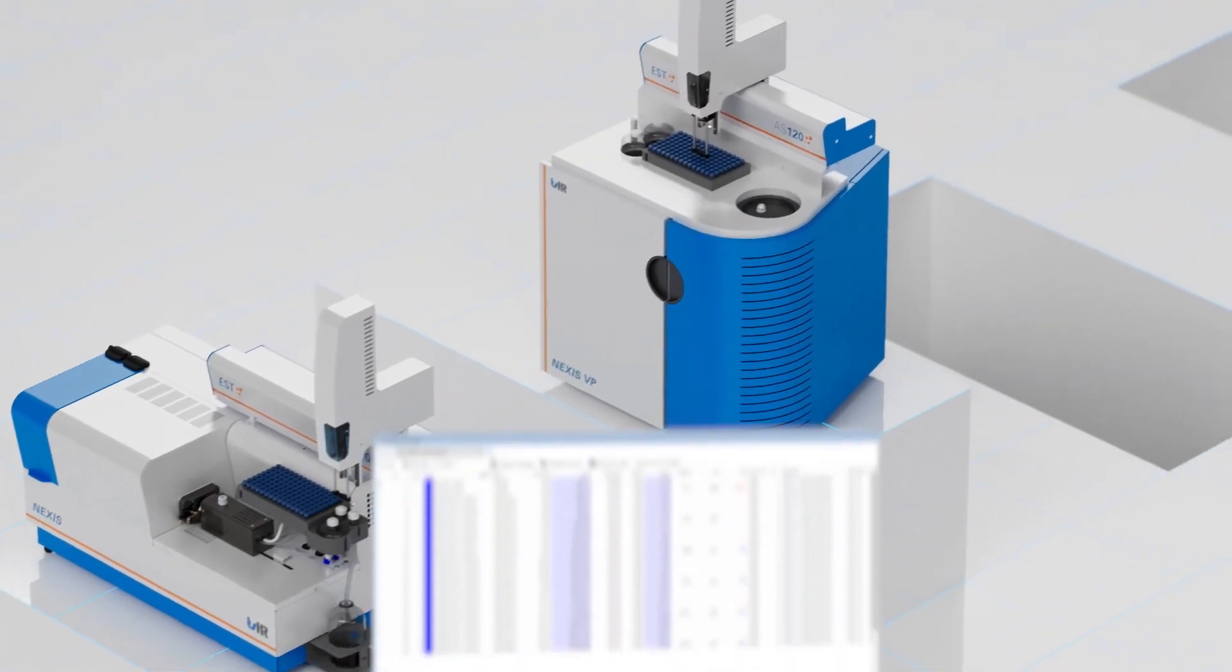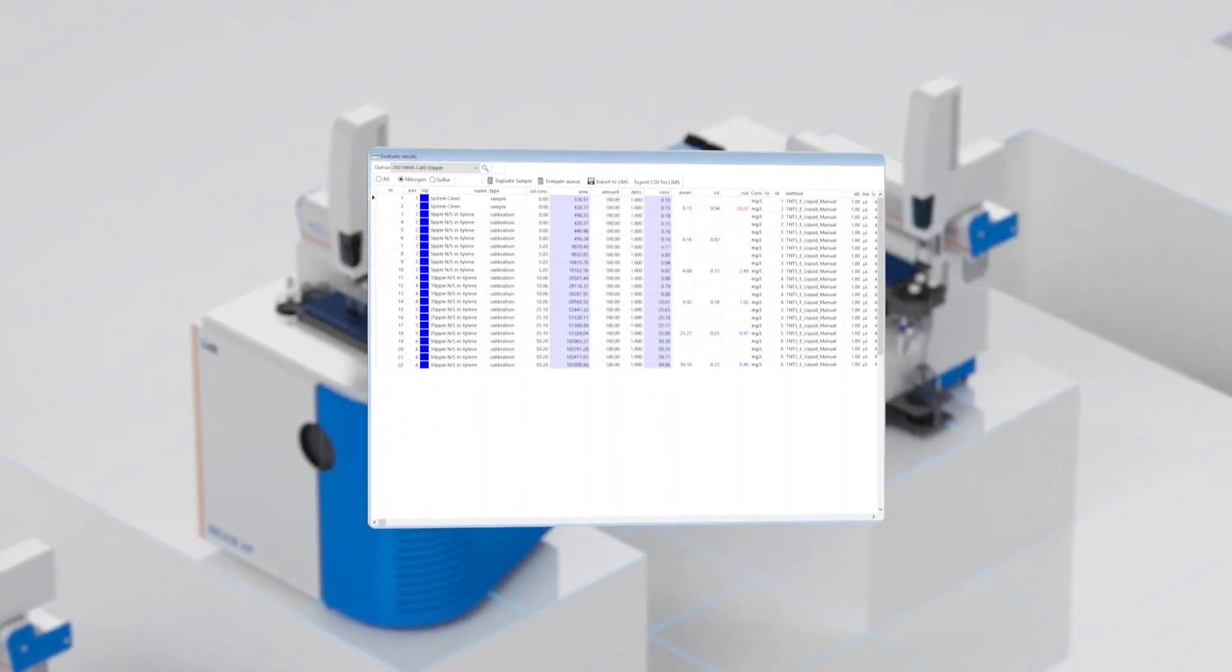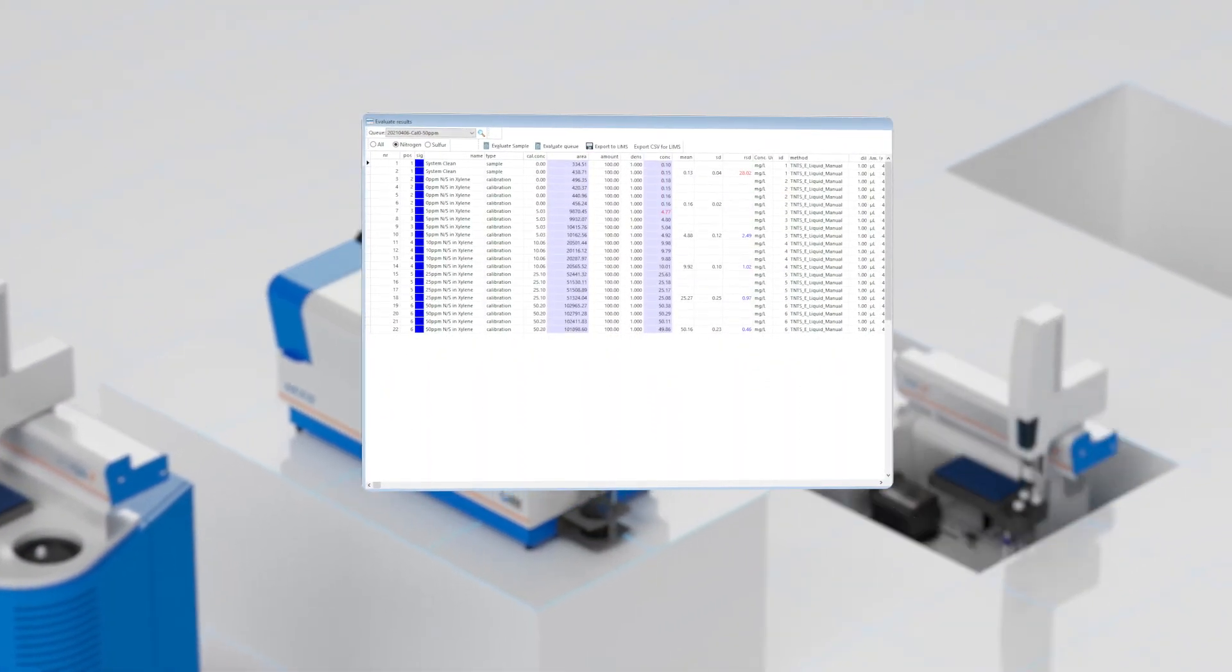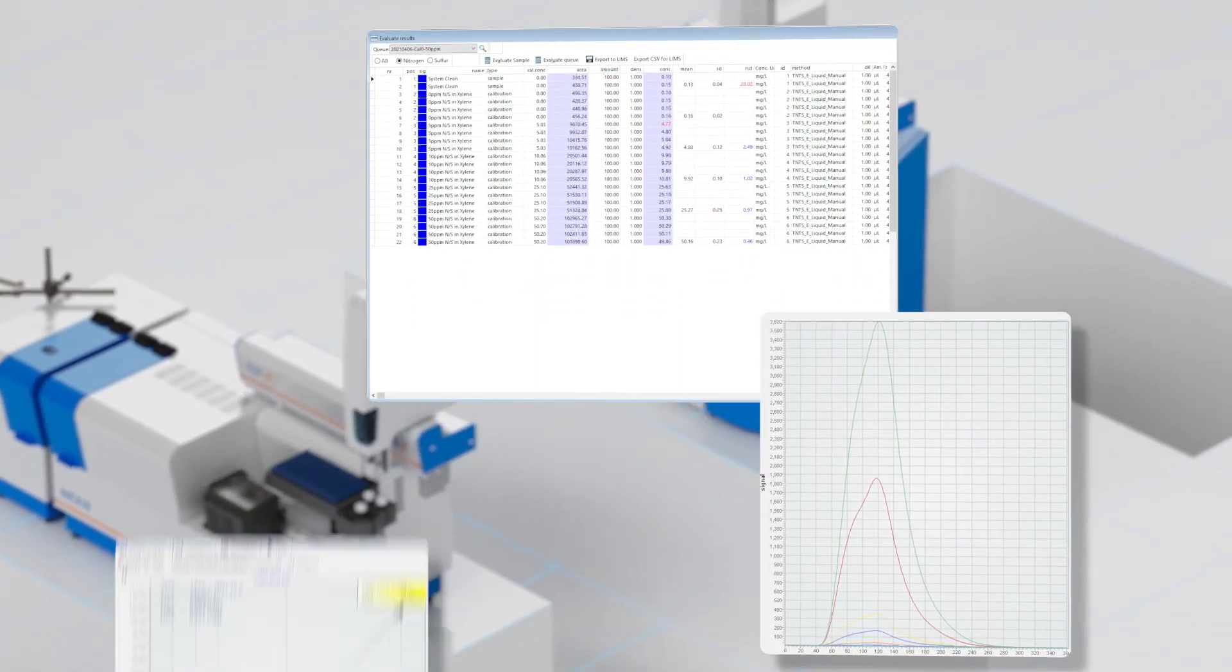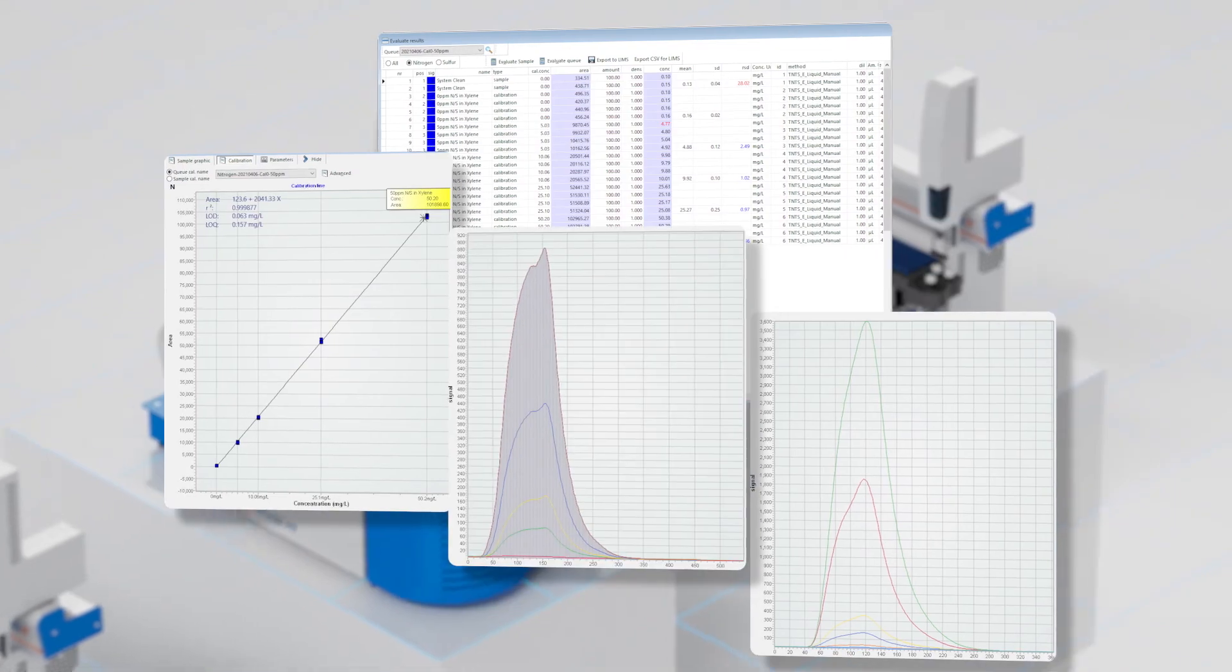In every configuration, the intuitively designed and easy-to-use NEXIS Link software supports the operation and data handling of the NEXIS. This includes the ability to edit predefined methods, adjust calibration curves, and view real-time peak integration.